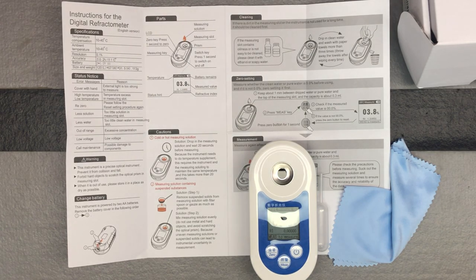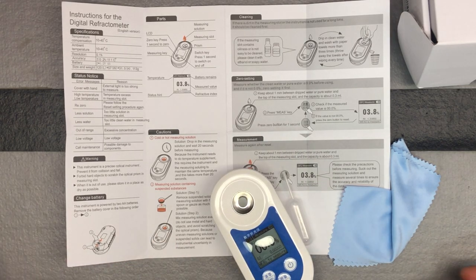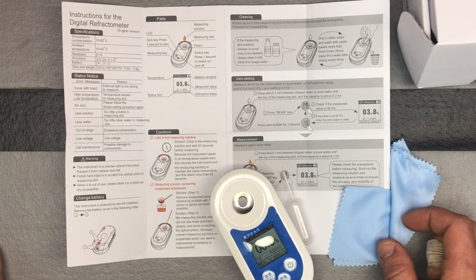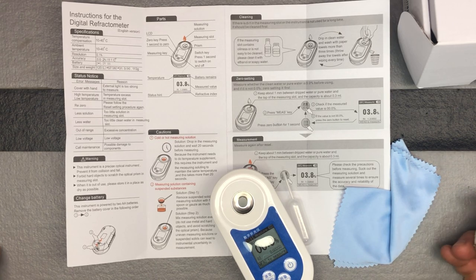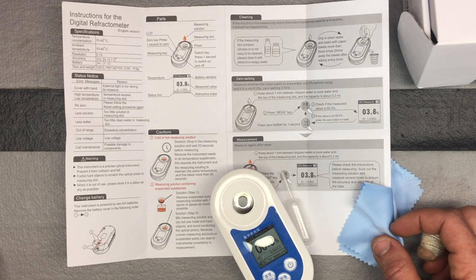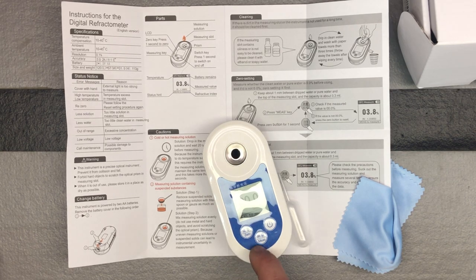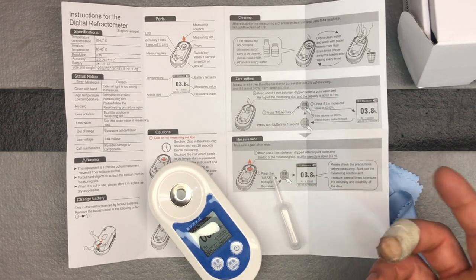I'll do a follow-up video where we actually test some different types of sugary substances to see how much sugar is in them. For cleaning, you can wipe it down with either alcohol or soapy water and dry it off really well. It's very easy to use because there are only three buttons: a power button, a measure button, and a zero button — that's all you really need.